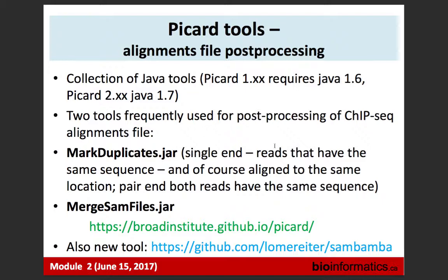There is another one which I tried recently, and actually at the Genome Sciences Centre in production they're moving to Sambamba. I tried it, and it's a very good tool. It's actually fast. The point is that we have to mark duplicates after we have our BAM file, as a separate step. There are also steps of sorting; we'll go through them. Now I have a question for you, yes.